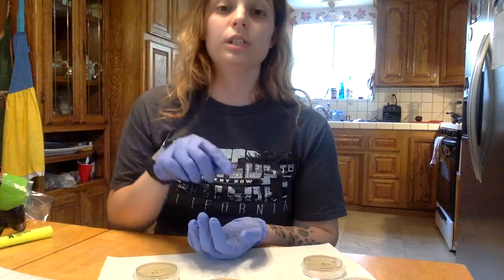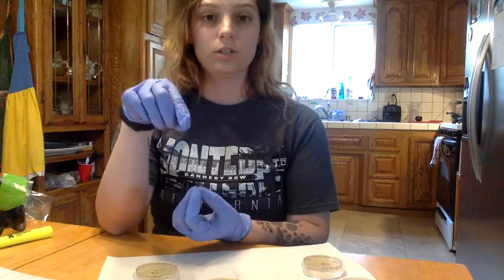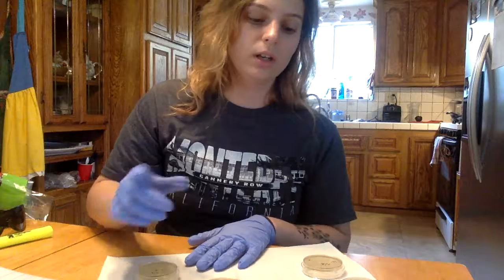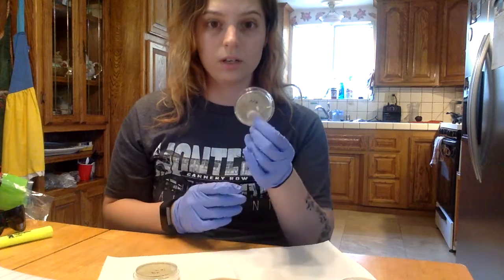I then had to dilute it from the first tube, the 0.25 milliliters from the first tube into the second tube, and then so on and so forth. So go from the second tube to the third tube, all the way to the last one. I then had to take 4 drops from each tube into the corresponding numbers that are on the agar plates.